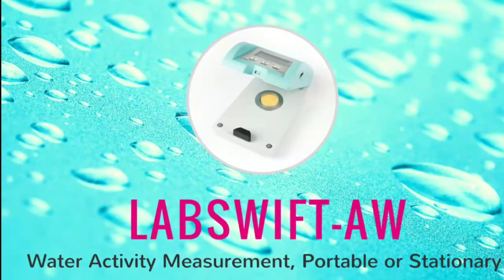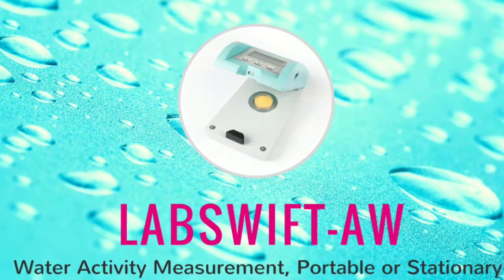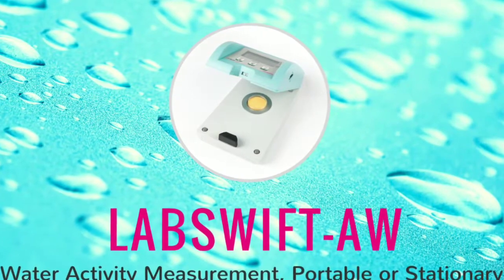Nova Zena's Lab Swift AW is a portable measurement instrument for accurate and fast water activity determination.